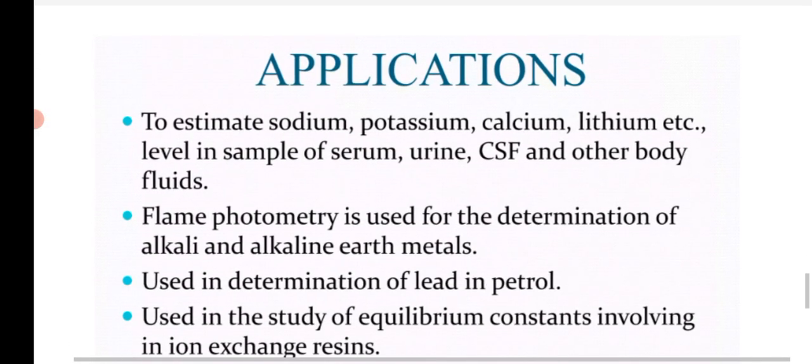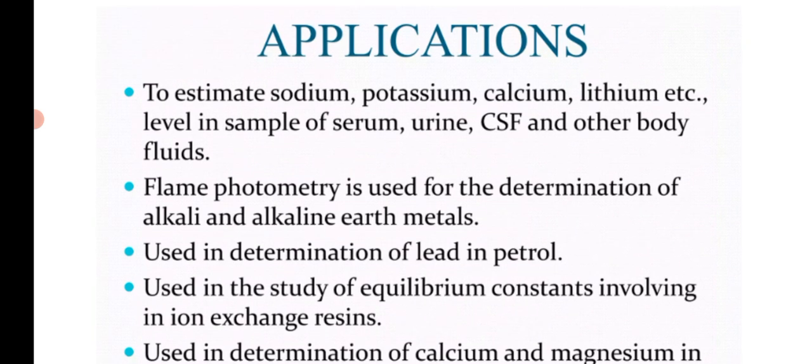And also, there are some applications. Flame emission spectroscopy is used to estimate sodium, potassium, calcium, lithium, etc., levels in samples of serum, urine, CSF, and other body fluids. So here they estimate sodium, potassium, calcium, lithium. The sample is present in body fluids like serum, a blood sample, urine sample, CSF, and other body fluids also.